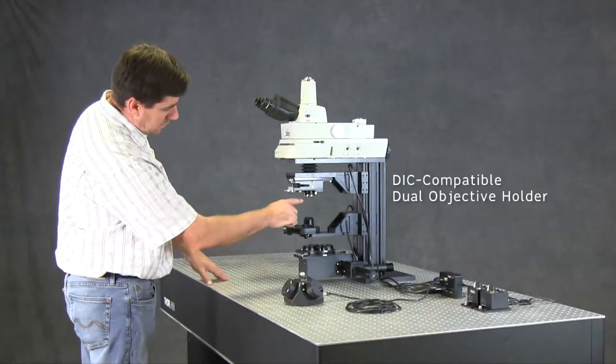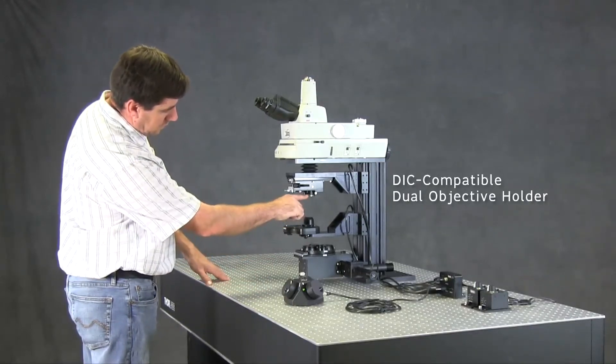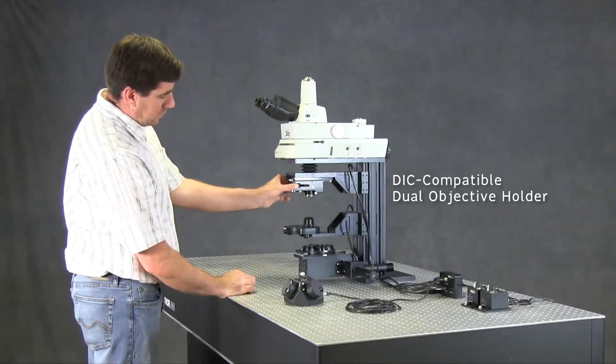The dual objective holder has two positions, both of which have a slot for a DIC objective prism.